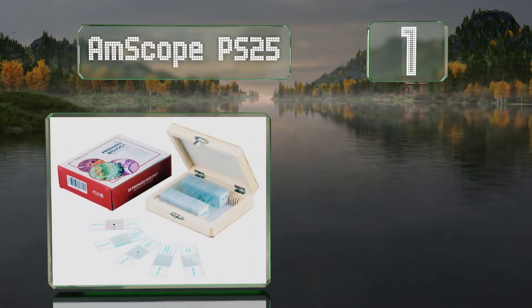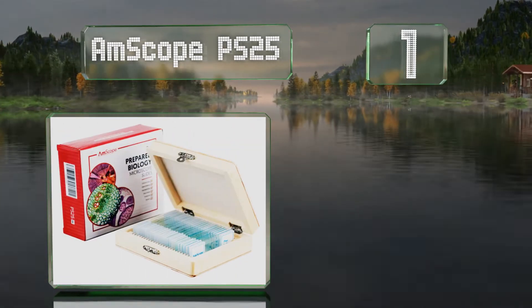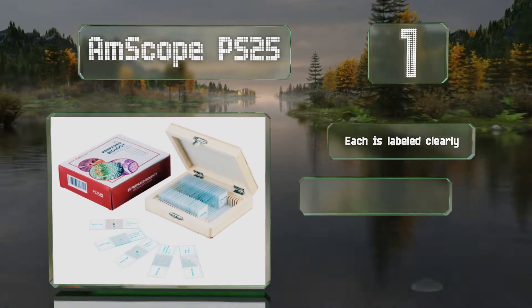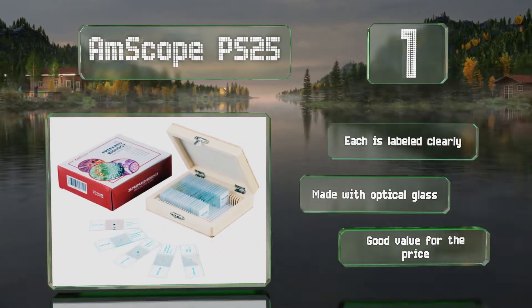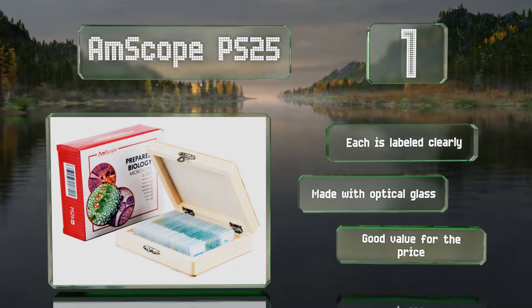Coming in at number one on our list, the wide variety featured in the AmScope PS25 includes everything from a human blood smear to cross sections of a rabbit's spinal cord, a pig's motor nerve, and a sunflower stem. They're preserved in cedarwood oil and sealed with sturdy cover slips. Each is labeled clearly and these are made with optical glass. It's a good value for the price.